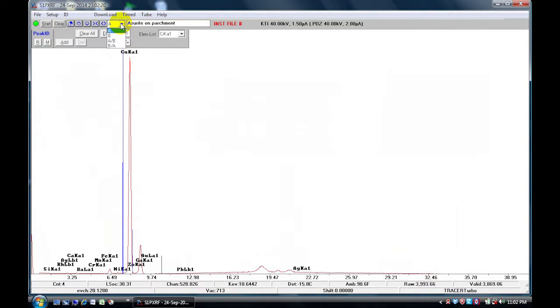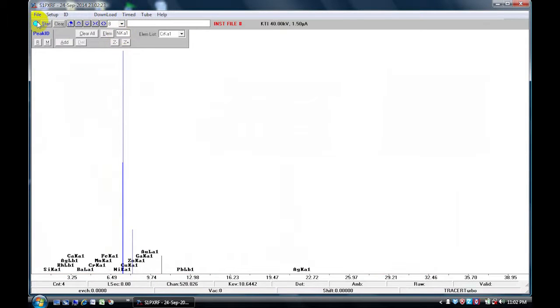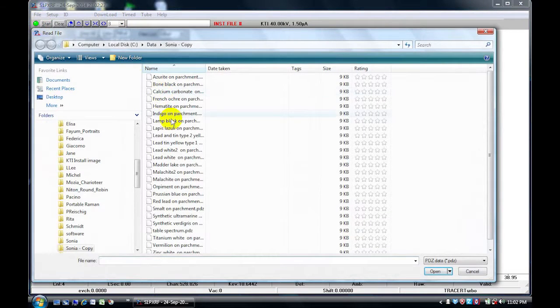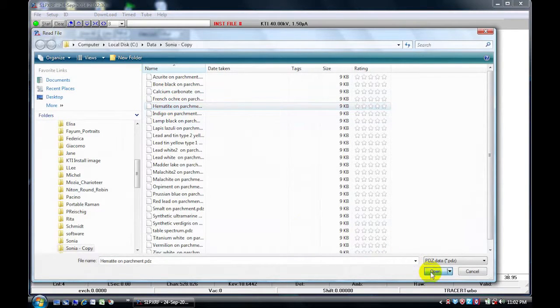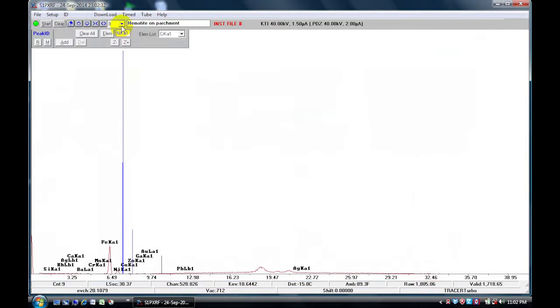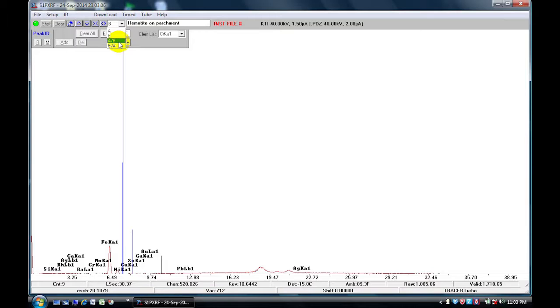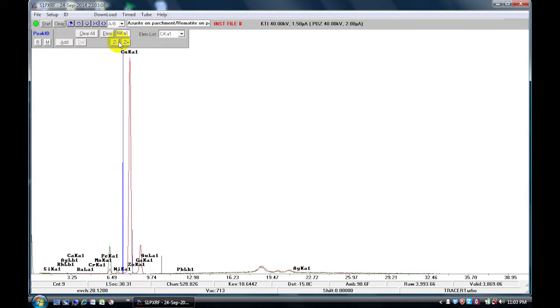Now go to the drop down and click on B and open your file of interest for B. If you go to A over B or B over A, the only difference is that you're choosing which spectrum to be active. And the active spectrum is the first one, the one on the left side, and that will always be red. The second spectrum, the one on the right side, is always green. So if we do A over B, A is the active spectrum and it will be red, and B is green.